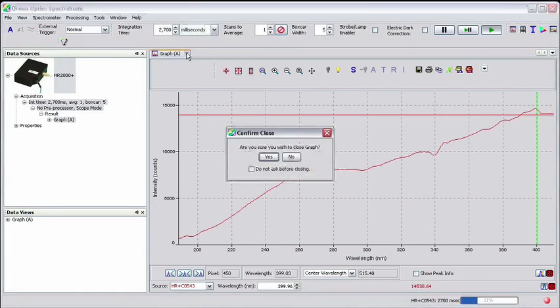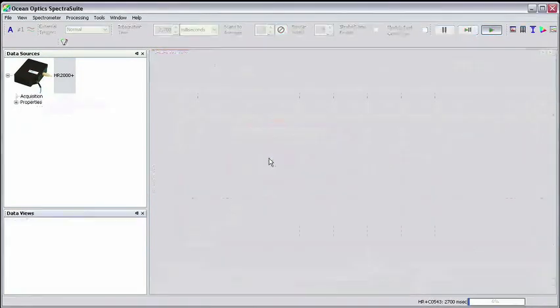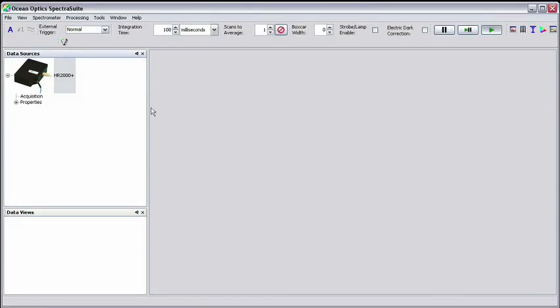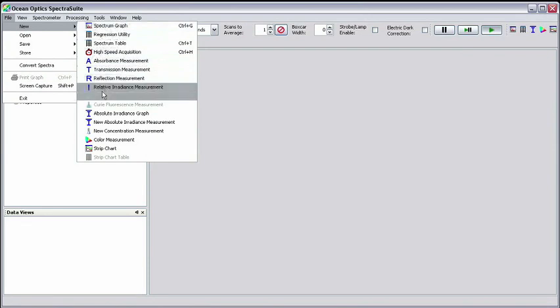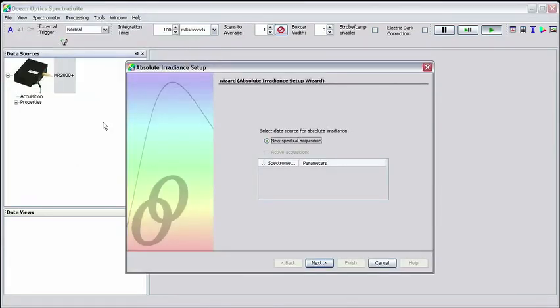Now, we'll start a new absolute irradiance measurement by clicking on File, then New, and New Absolute Irradiance Measurement in the menu. You'll see the Absolute Irradiance Setup Wizard appear.